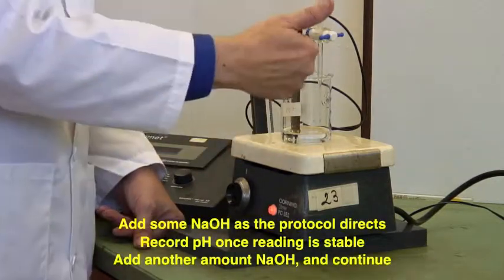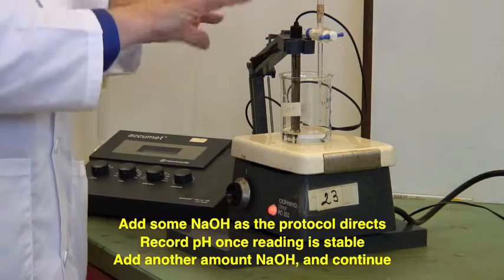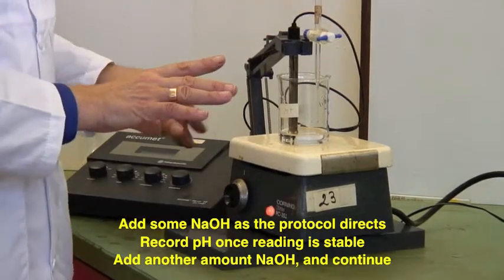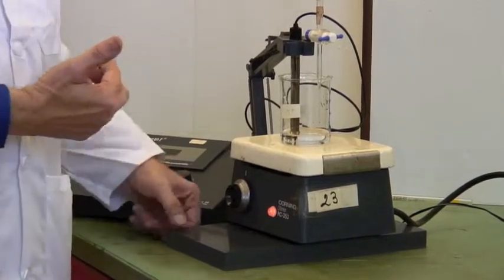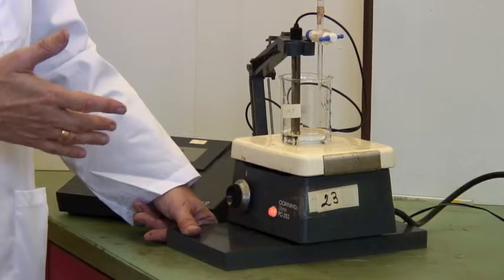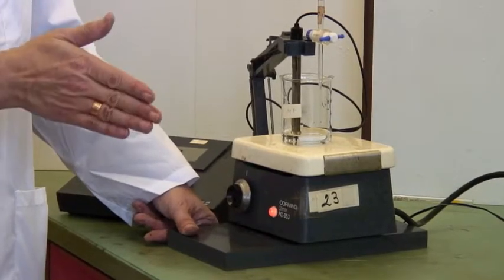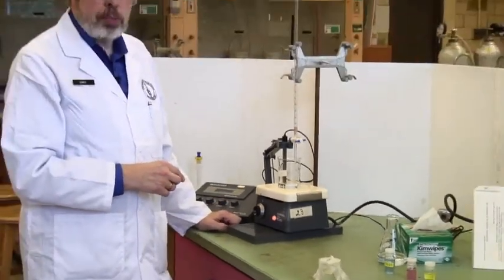Turn on the stirrer and add the first amount. Let it sit for 15 to 30 seconds, then read the pH. Add more, keep stirring, and read the pH again. That's how you perform a pH-monitored titration. You won't see color changes, only numerical changes on the pH meter display.